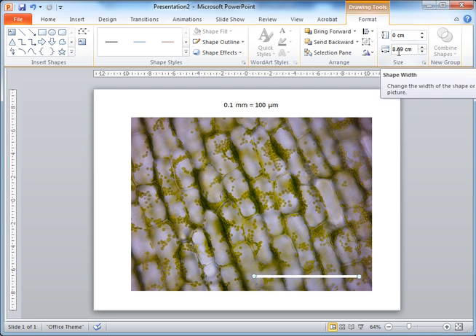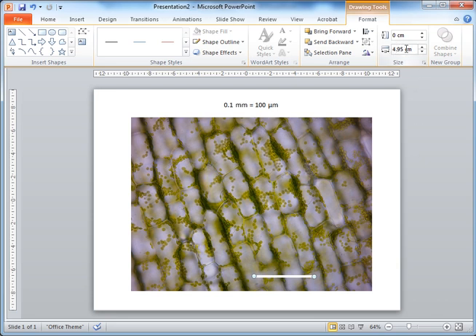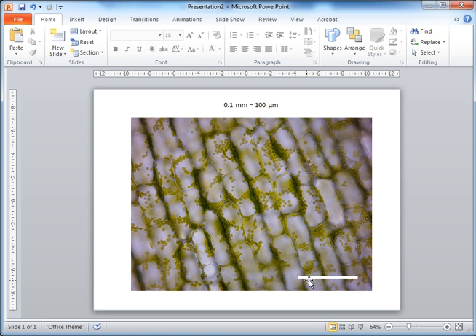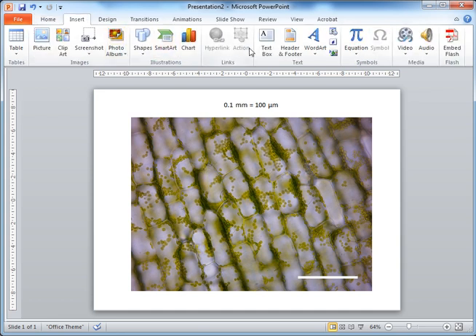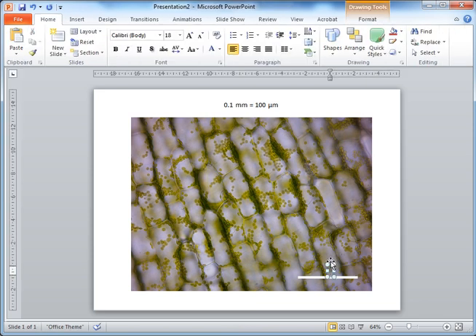To change the length of the line, click into the width box and type 4.952, then hit Enter. PowerPoint will round it to two decimal places. Drag the line into the corner so it looks neat. We now know this line on this particular image represents 100 micrometers of the actual biological sample. Next, go to the Insert tab and insert a text box, clicking somewhere above the scale bar.